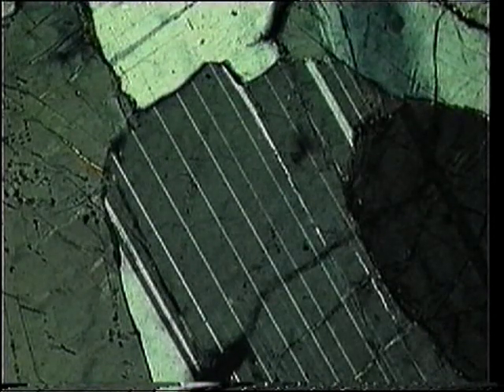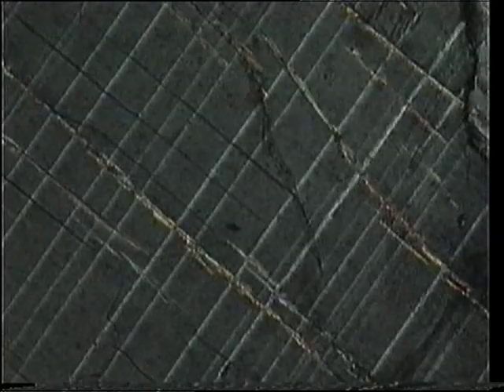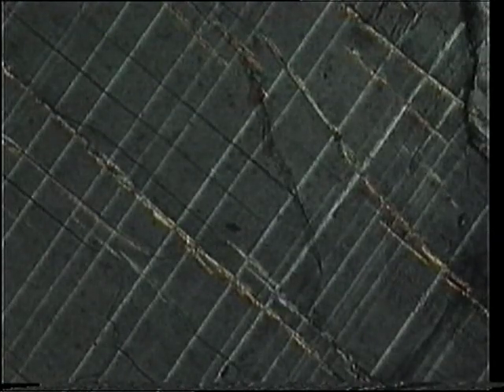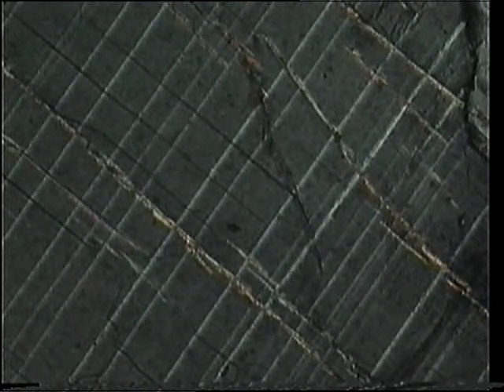The same applies here. 010 is normal to the plane of the section, but 001 is absent. Here, 001 is sharp, but 010 isn't. And this is the type of grain we want. Both directions are sharply defined.